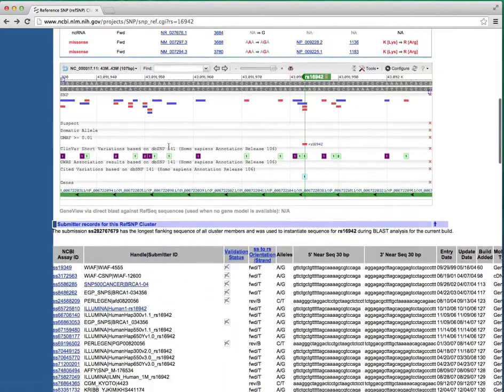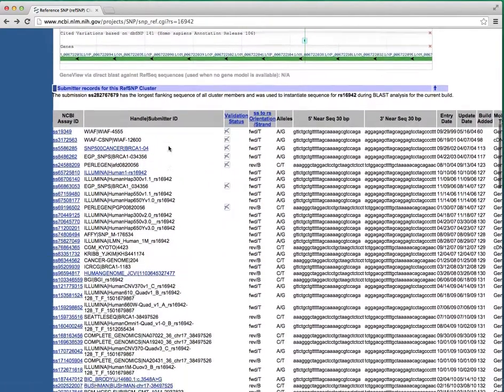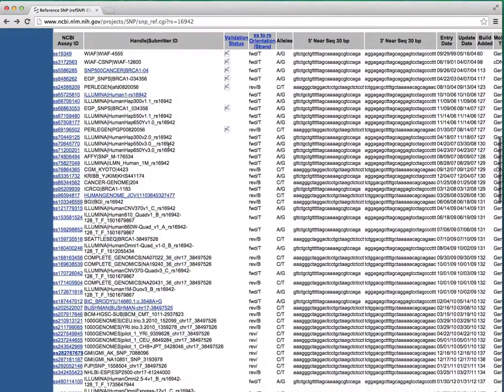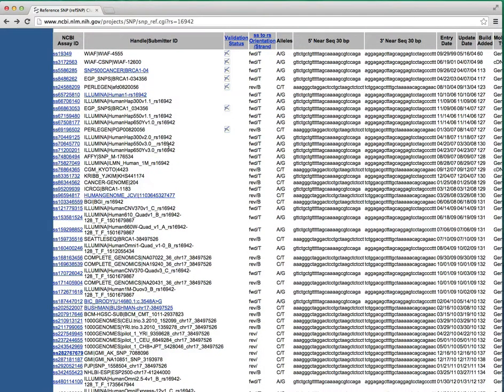Scrolling down the page to the Submitter section shows all the separate submissions for this SNP to dbSNP that have been put together to form this entry.